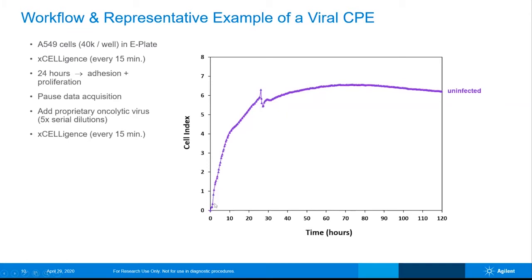These A549 cells show 3 distinct phases in this impedance trace. The first phase is really cellular adhesion, and this typically happens over the first 10 or so hours. Of course, the cells will touch the bottom within usually 30 minutes, but they spend the next 10 hours really attaching more strongly and spreading out, and that gives rise to this steeper phase of the curve. We then typically see a second phase, which is a bit slower, which correlates with proliferation. You can confirm all this by microscopy.